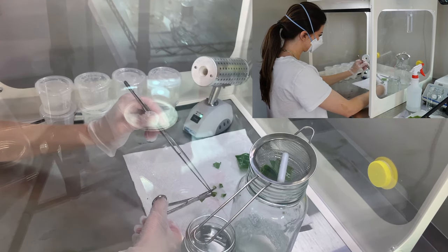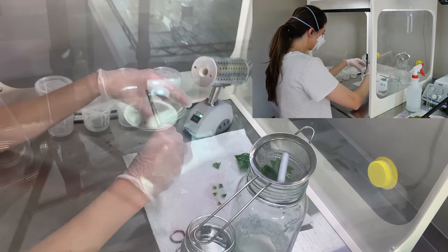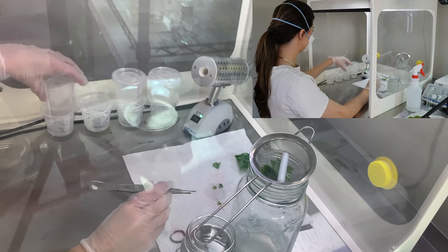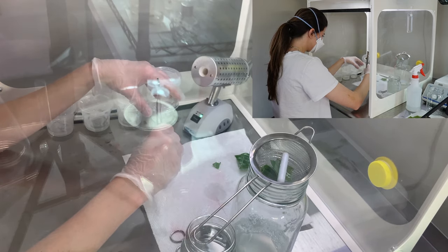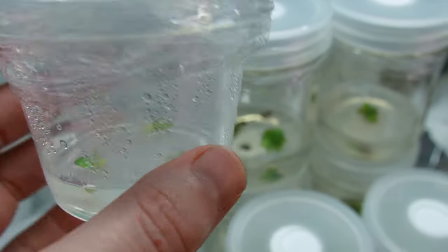I place about three explants into each container of media. I really like the deli containers but the condensation can be really annoying. Here are what the final products look like. I ended up with about six containers.